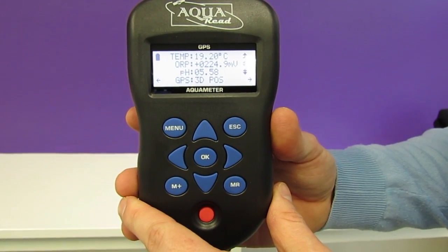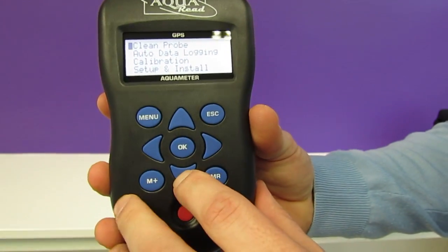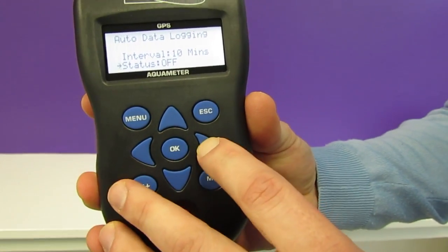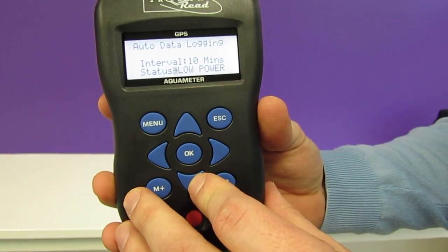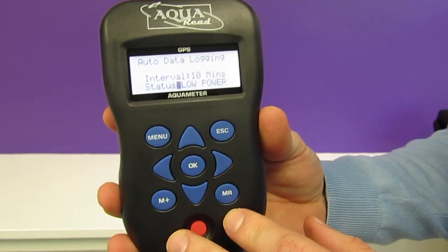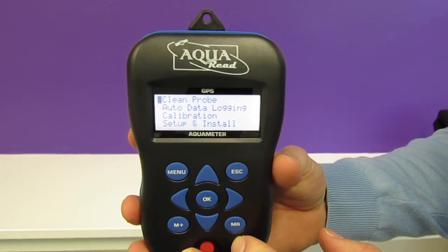One of the newest features of the GPS Aquameter is the low power auto data logging mode. To find this we go into menu, auto data logging, scroll down to status and select low power mode. In this low power mode the entire system will go to sleep in between readings, maximising the battery life. In this setup you can log for up to 38 days continuously.